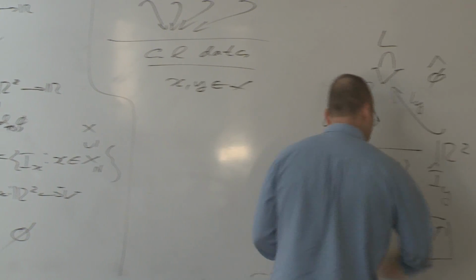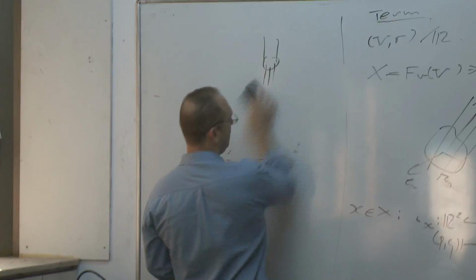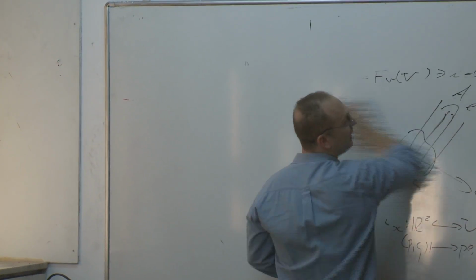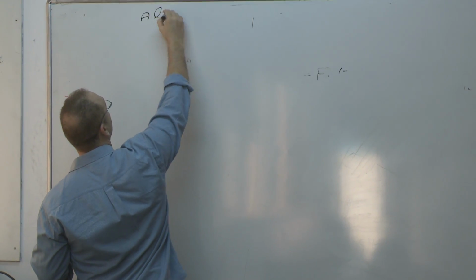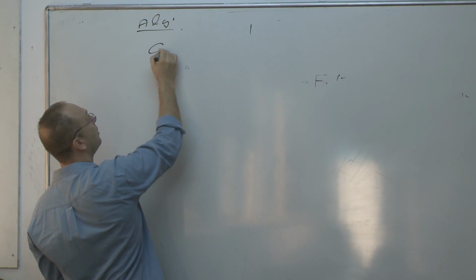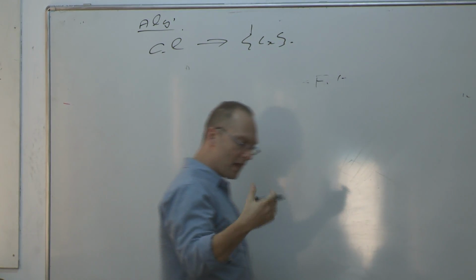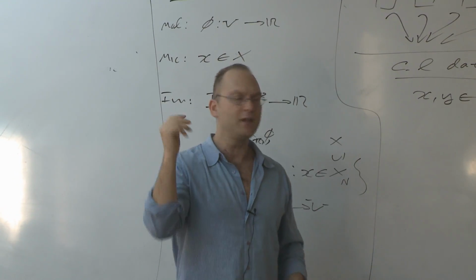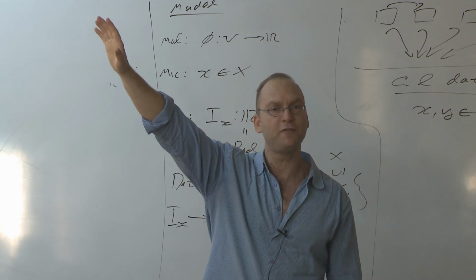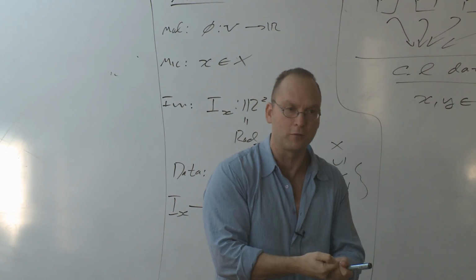Okay? And now the algorithm, which I want to explain. What the algorithm does, it accepts as an input the common line data and produces as an output the orthogonal embeddings. So this is the intrinsic reconstitution algorithm. It accepts as an input the common line data and produces as an output these embeddings that we want to compute. And this is the main idea. What the algorithm does, we compute from the common line data a three-dimensional Euclidean vector space that is very different than the vector space V that we started with. And then we solve for the embeddings in the coordinates of this new vector space.